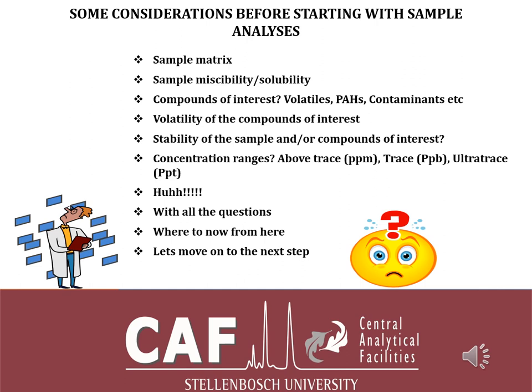Or if your compounds of interest are very volatile, you might have to prepare your samples in small batches. Especially if your lab is not cool enough, your aircon is not performing well, you can prepare all your samples and keep some of them in the fridge until they're ready for injection. Depending also on the length of the method, I might have to add on samples in an hourly period, for instance, maybe your first 8 samples, and then the next 8 before you go home.